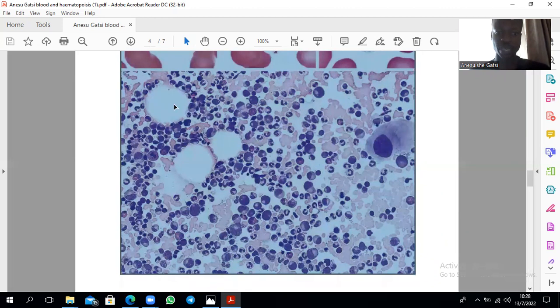Then this is a bone marrow smear. The bone marrow smear shows us these are adipocytes, right? Then if you come this side, that's a megakaryocyte. Remember I said a megakaryocyte will be polyploid. That's a megakaryocyte. Right. Right here we'll be having erythrocytes. Right. Then that developing right there, that's an eosinophil. That's another eosinophil there. Right. Then the white regions, those are going to be fat.